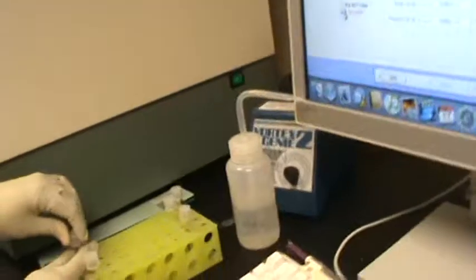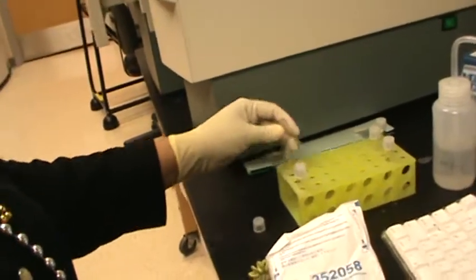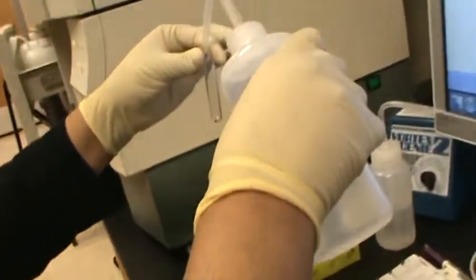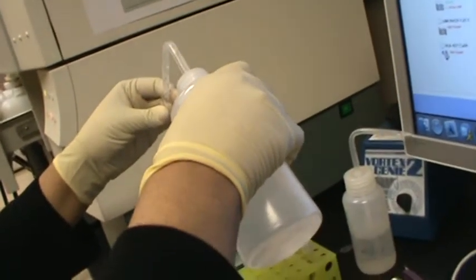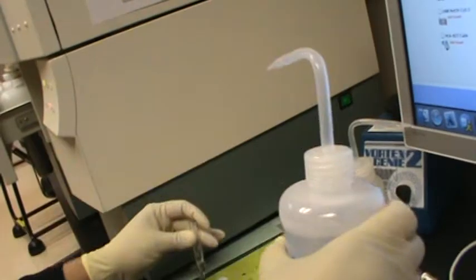So when you run your beads, they are different. This is PE. That's PE. So you have two samples you're running, a labeled and an unlabeled. The unlabeled has about 1 ml of sheath fluid. You can measure with the pipette or you can gauge. That's about 1 ml.